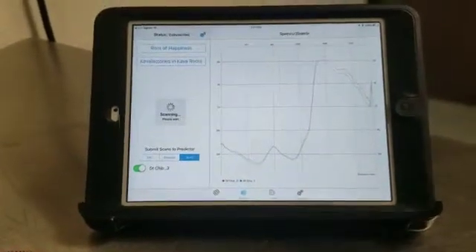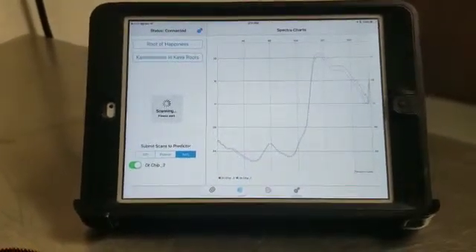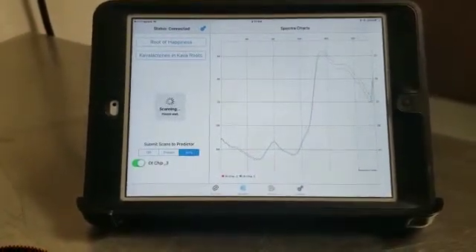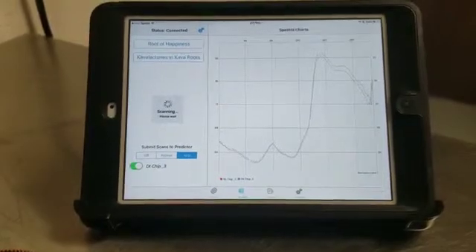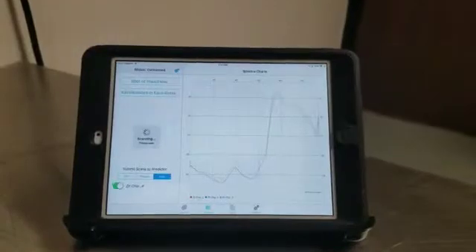We want to make sure that our spectra is relatively close together, and we don't have an outlier, so we want to make sure that we're getting good quality scans each time that we do this.